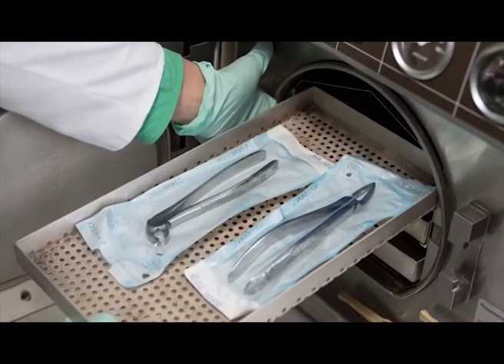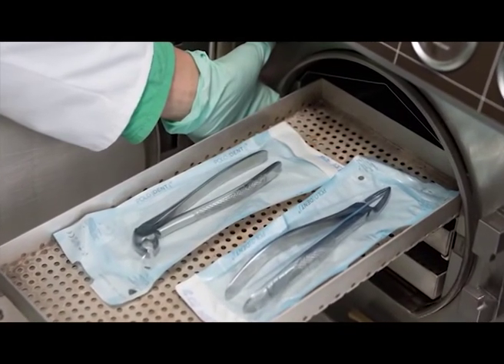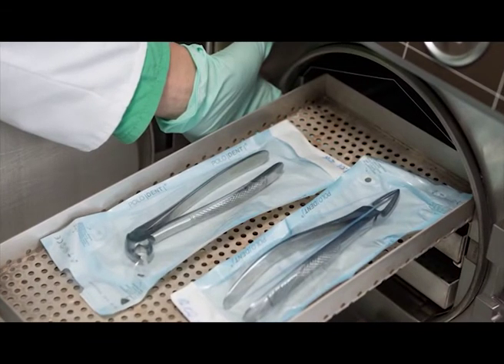A new set of sterile instruments should be used after every 4 to 5 animals. If the instruments have become contaminated by contact with a non-sterile surface or non-sterile portions of the body, such as contents of the gastrointestinal tract, a new sterile set of instruments should be used on subsequent animals.